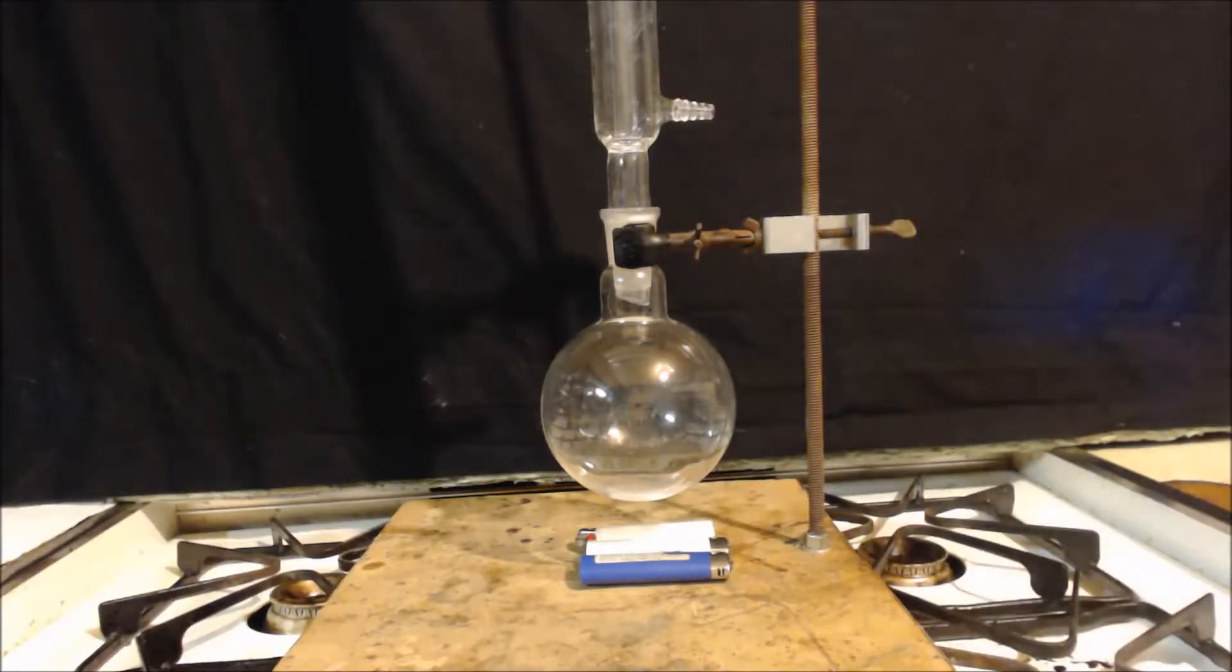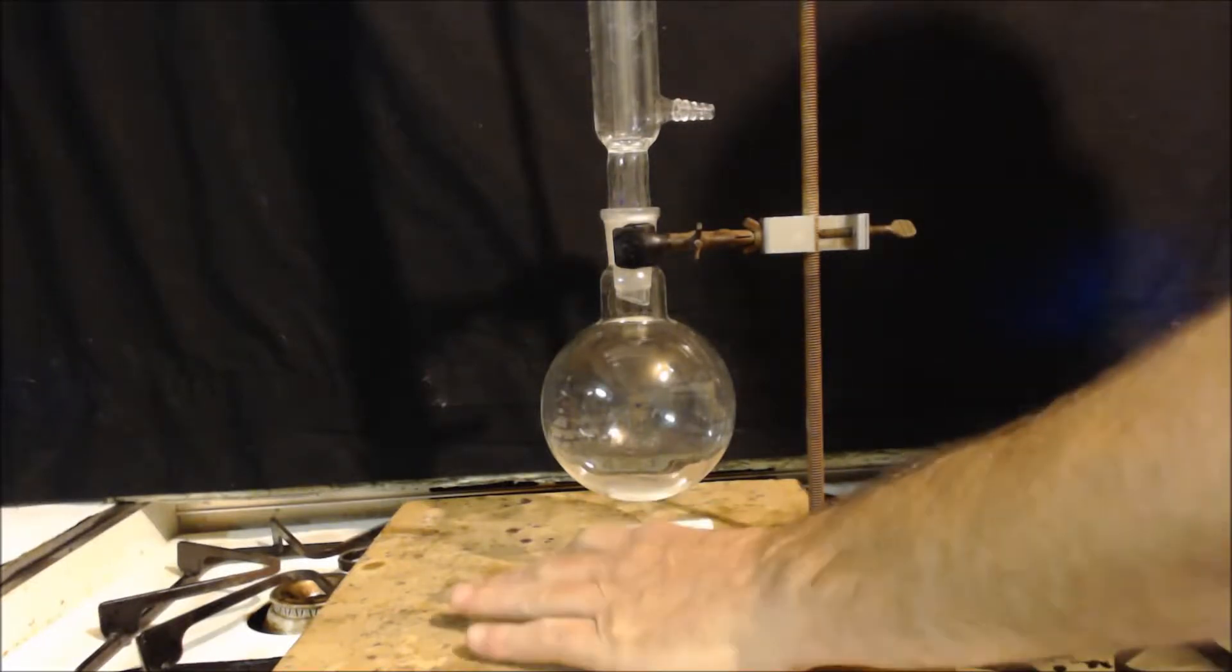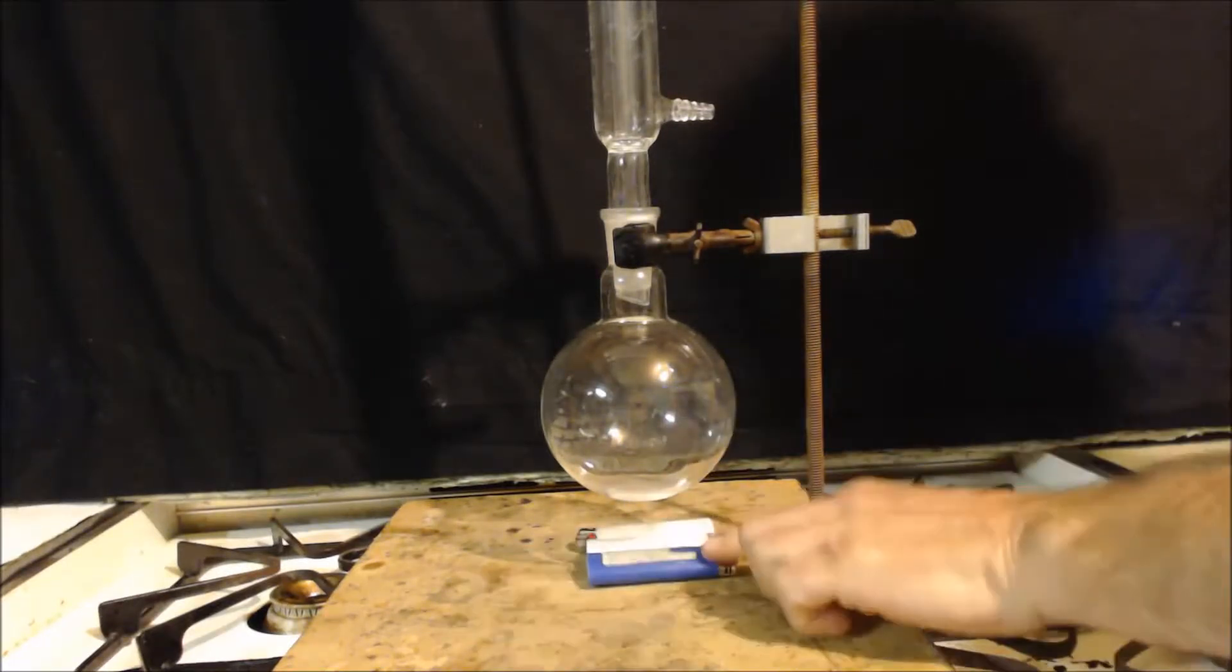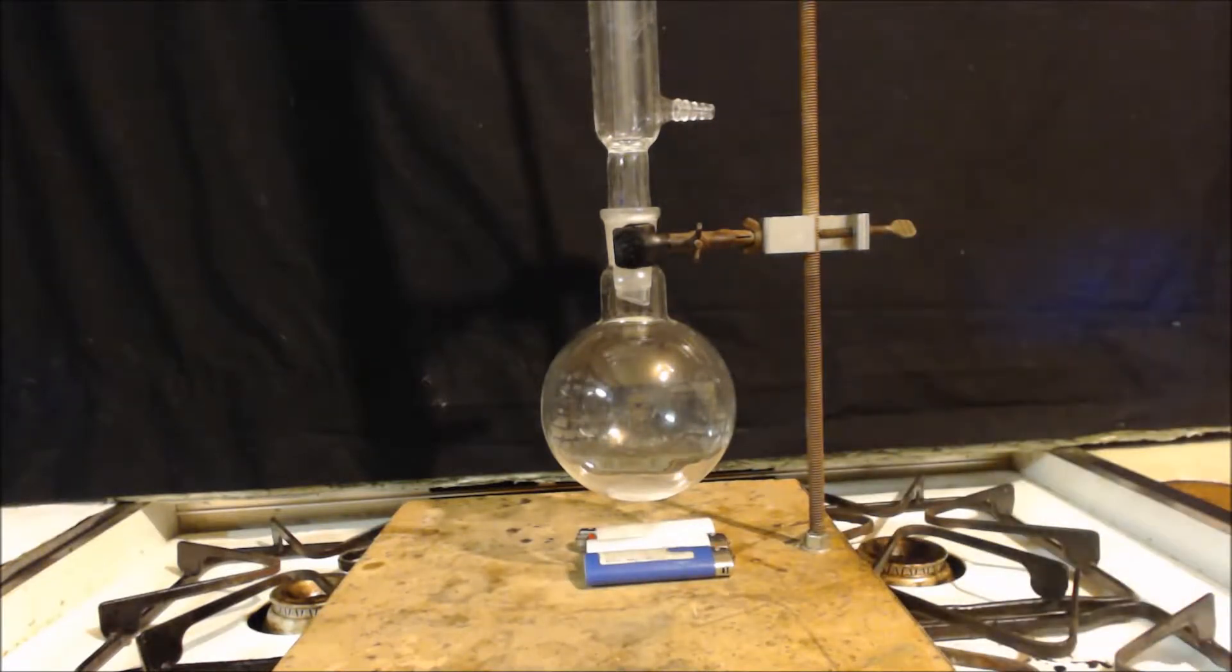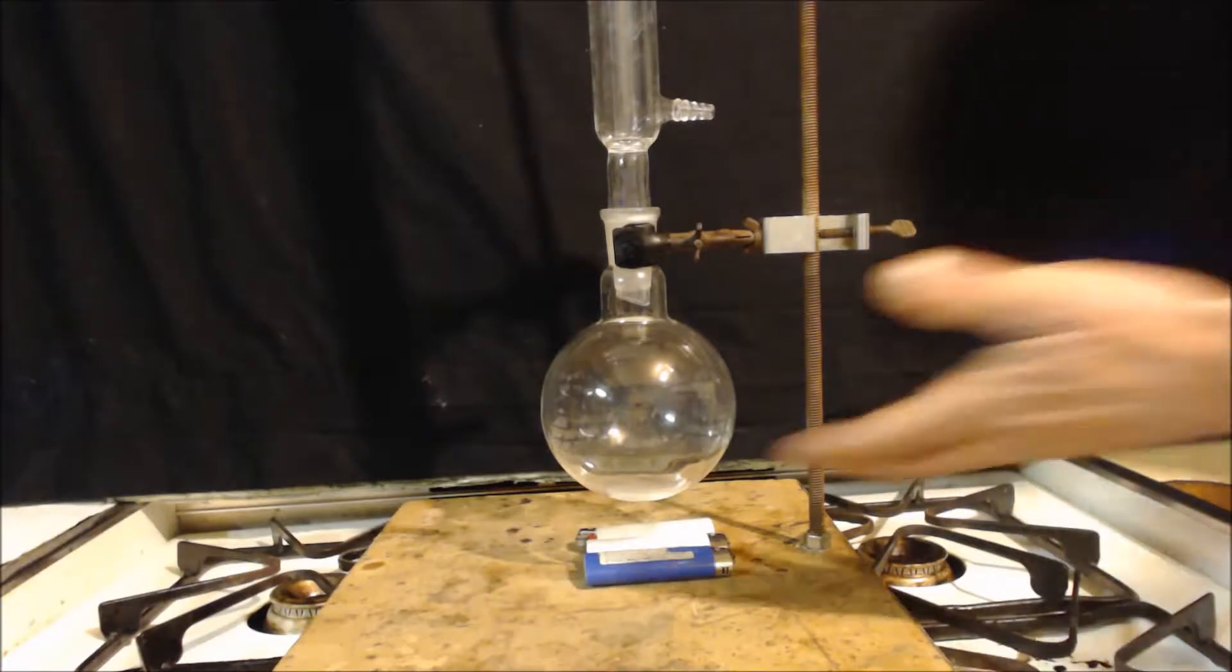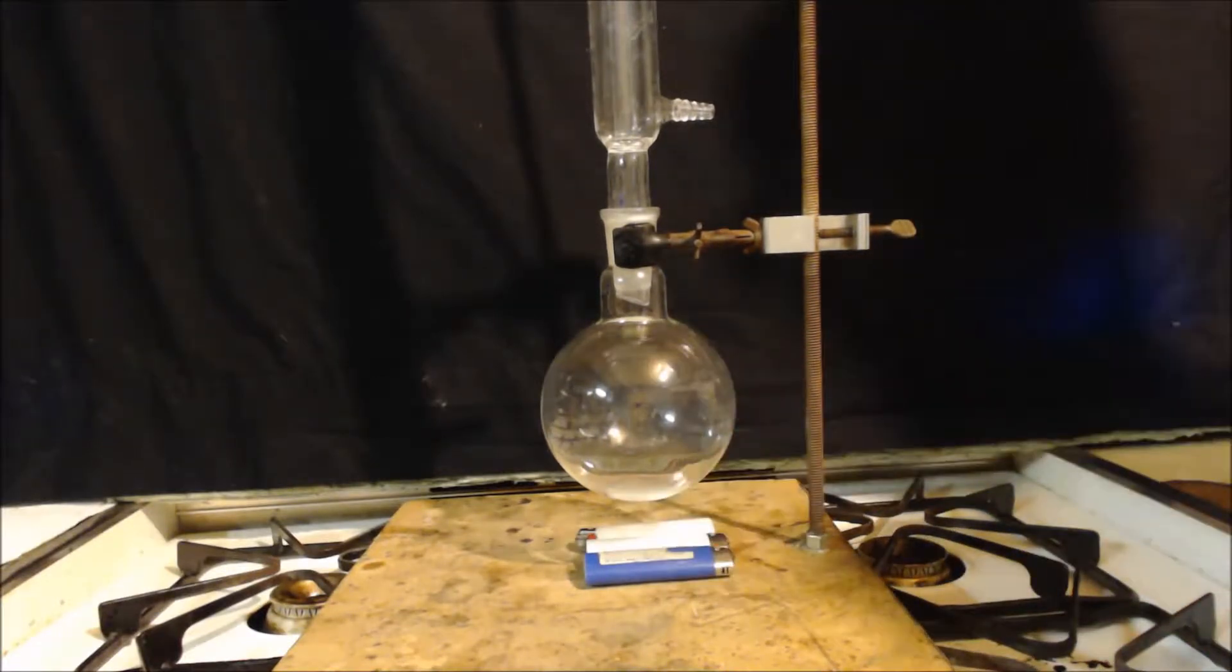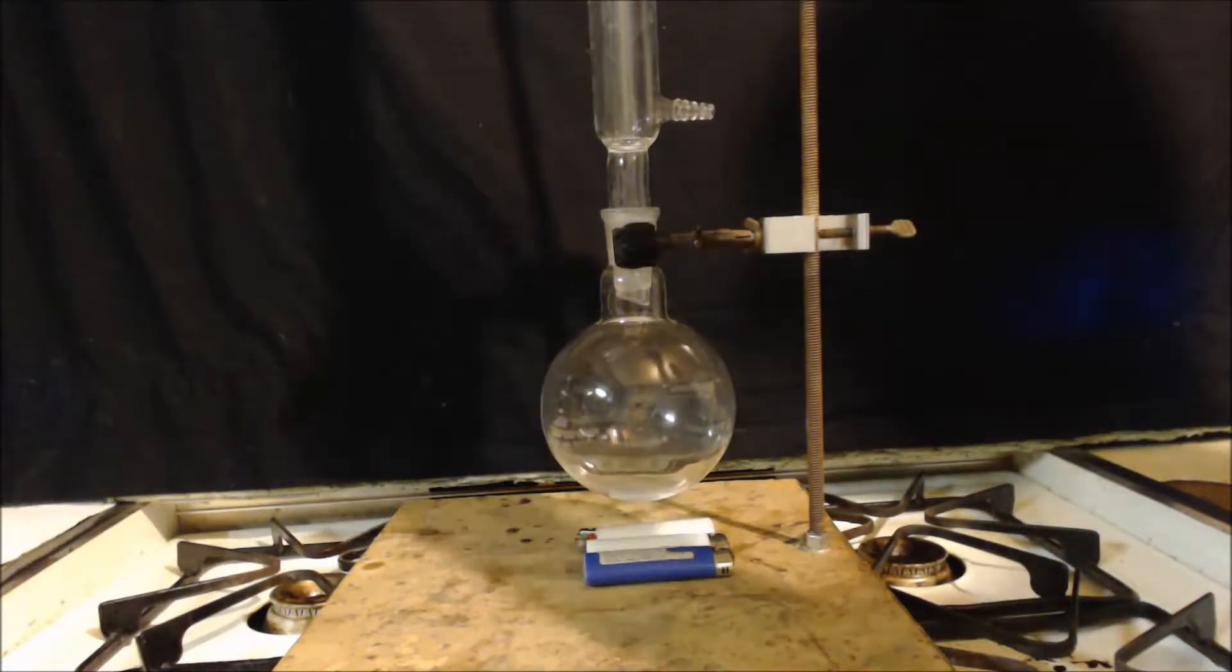Okay, there's basically only three parts to a reflux apparatus. One being your heat source, which I have lighters here to represent that. The pot, the flask that holds the reaction, that's always called the pot. So here we have a 500 milliliter round bottom flask. And the third piece is this condenser.